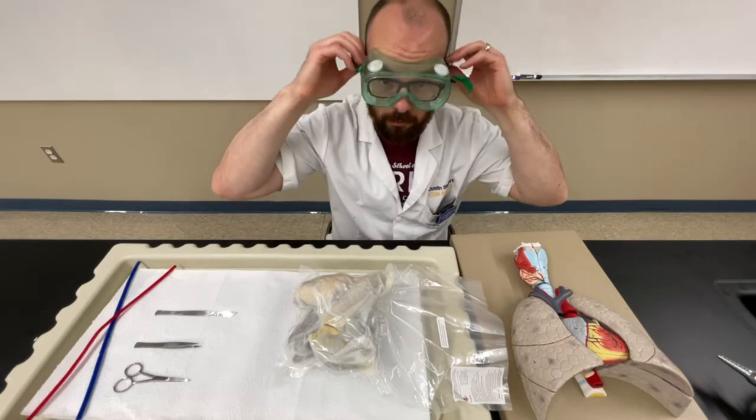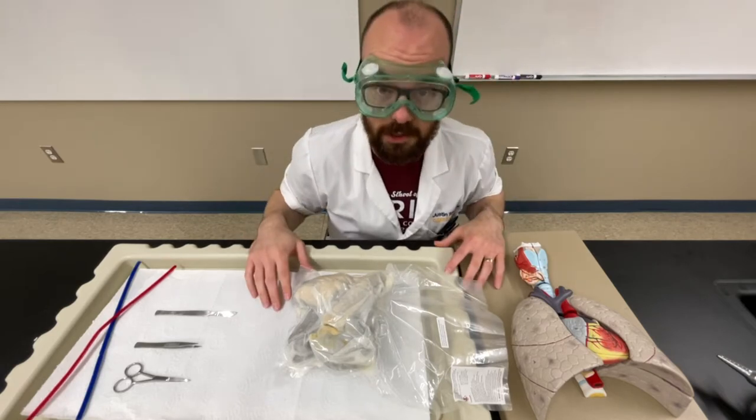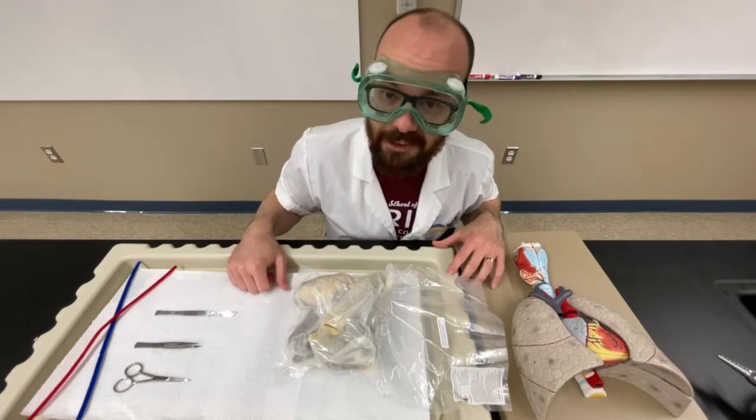Most importantly, make sure that you got your goggles on. So let's jump to the dissection tray and get started.